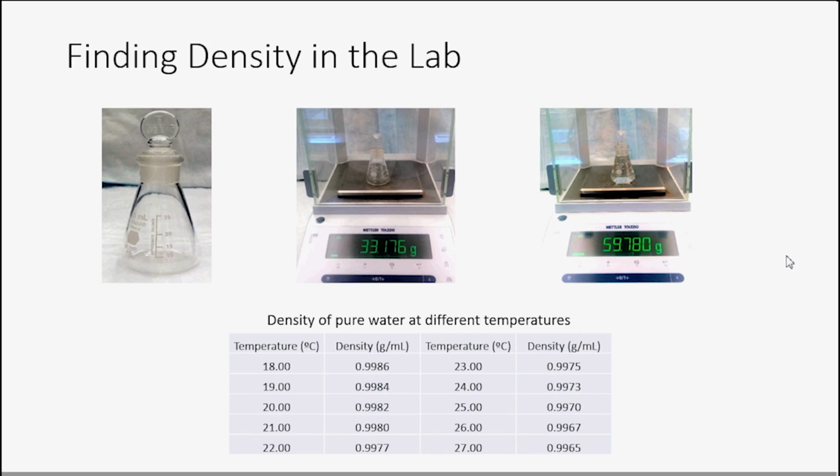In order to do this, you will fill the flask completely with deionized water and measure the mass of water in the flask by difference. Once you know the mass of water in the flask, you will use the known density of water at room temperature to calculate the exact volume of the flask with more significant digits than you would using a graduated cylinder.